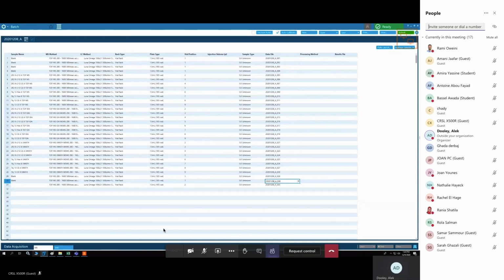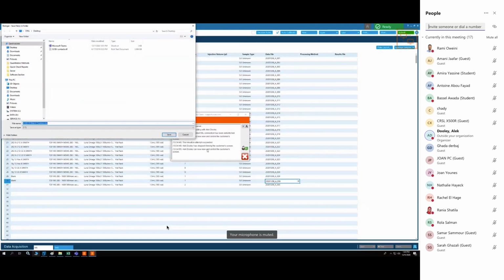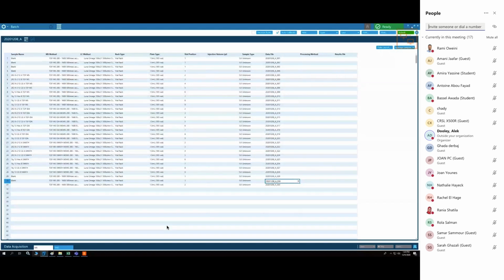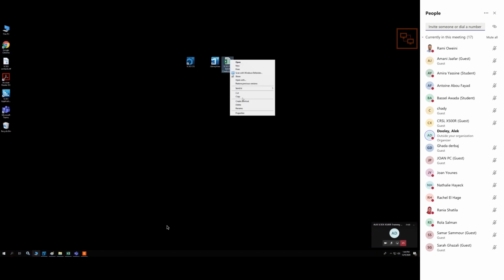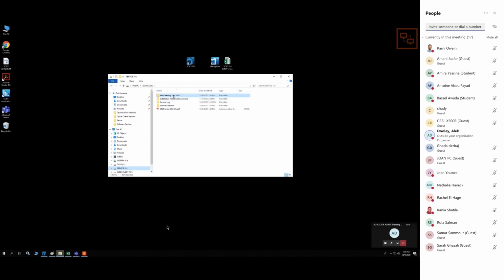Paste. And then here we go. Open. All right, so I'll put this on the desktop, and I'll put a copy on the V drive. Copy. So where is V? And then I'll put it in my training folder. All right.